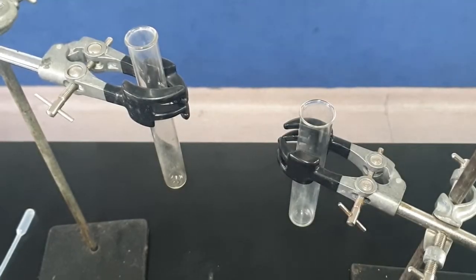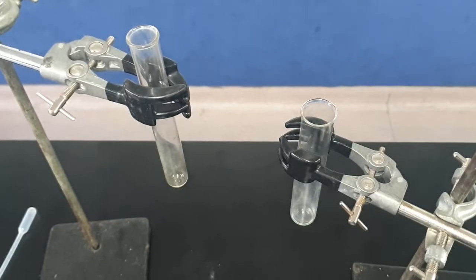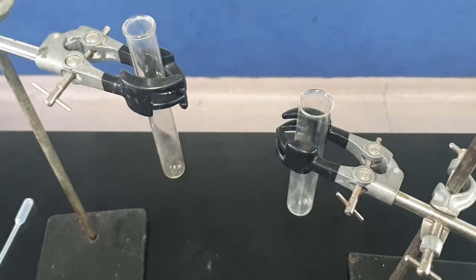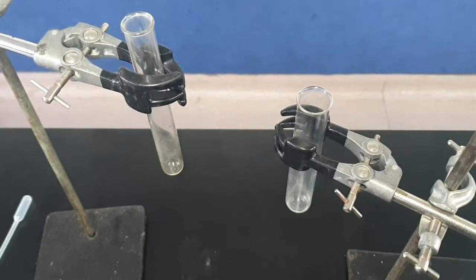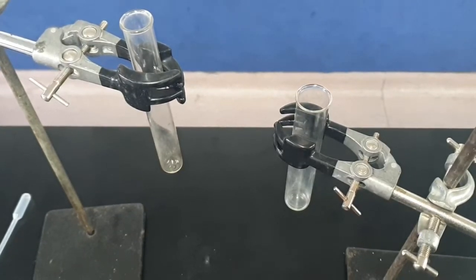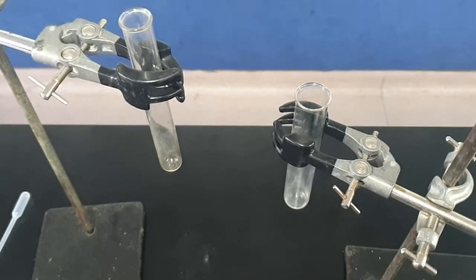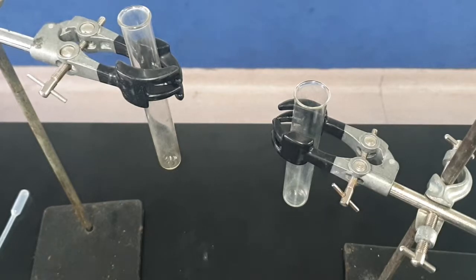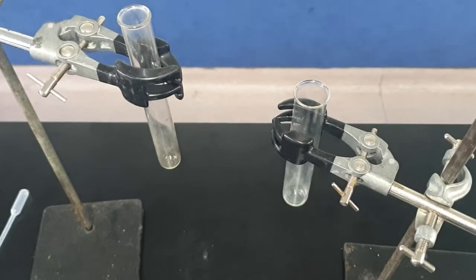In this practical demonstration, we're going to be looking at another example of a neutralization reaction. So in a neutralization reaction, we have a base neutralizing an acid. And if we mix too much of the base with the acid, it is going to become a basic solution. In this type of reaction, instead of using a base, we're going to be mixing an acid with a carbonate.